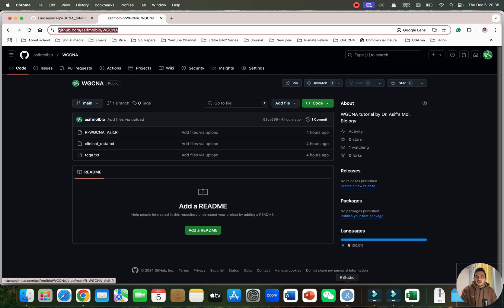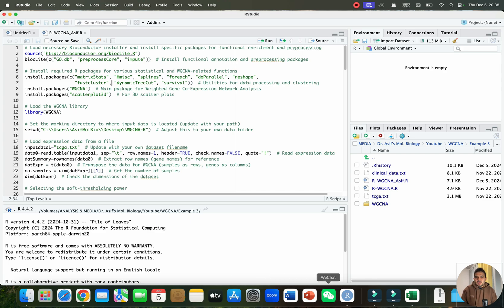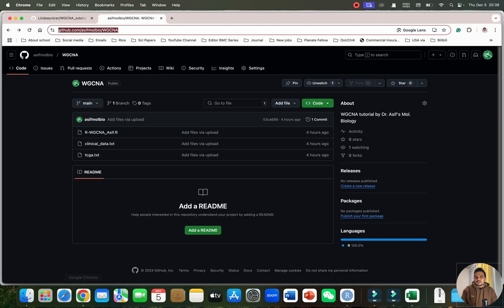This R script is special compared to others — it is relatively smaller, there are fewer errors, and you don't need to go through a long R script to perform WGCNA analysis. I have also uploaded the clinical data, which is actually the traits data.